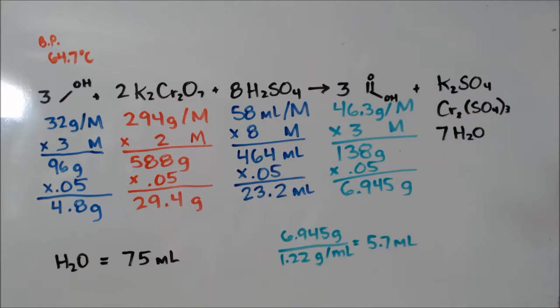I'm not going to account for the water. I actually distilled some of the water out too. I'm not worried about having too much sulfuric acid. If I have a little extra it's no big deal. With dichromate I want to put in a little bit more, like 31 grams, so that I know I have enough to oxidize everything.